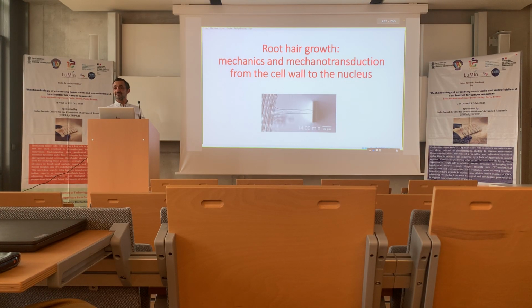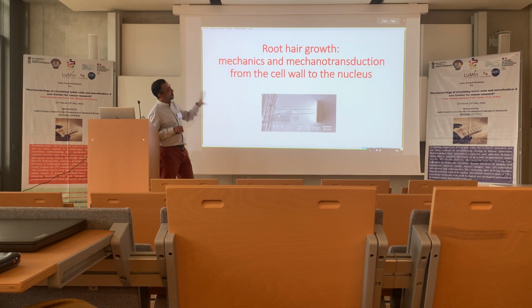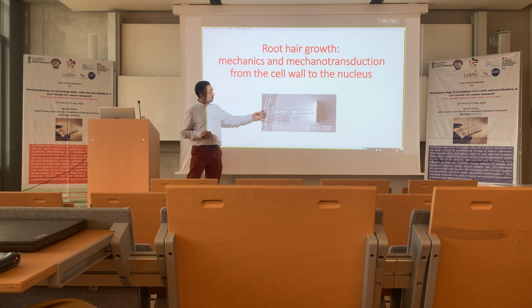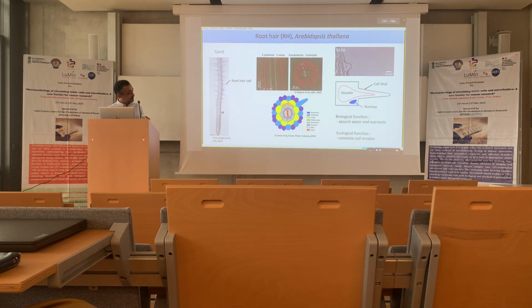And now maybe a very different one that I wanted to show you, because here you have some microfluidics, but maybe strange, I will show you. So here it's a very different system. So now we are in plants, and in these plants we have from the root one specific outgrowth. So this is part of the single cell that is growing and in fact invading the soil. So maybe I will comment on this here.